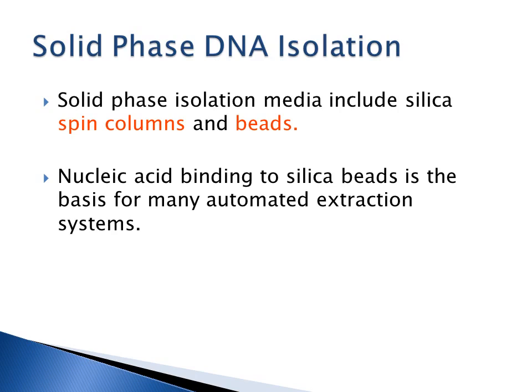You can also have spin columns that use silica or beads, where your DNA is going to attach to the beads, and then you could elute the DNA off of the beads. So it's a similar method to the solid phase spin columns, but it uses beads.